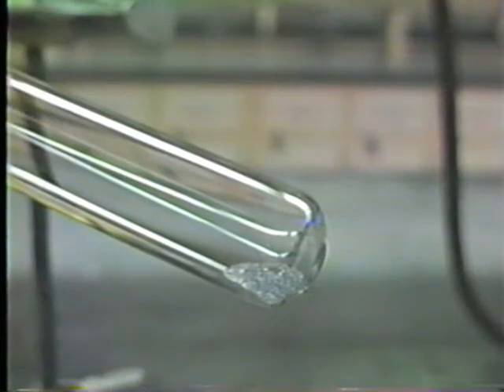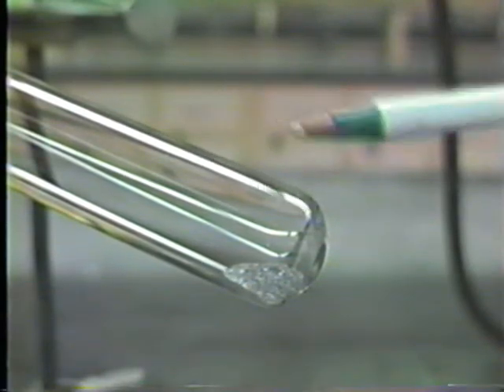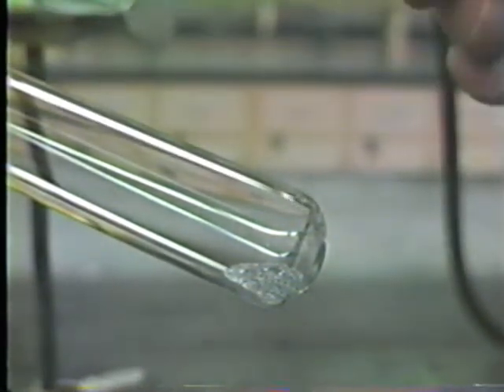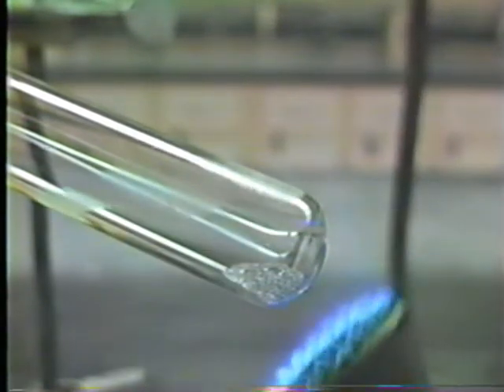Let's take a close-up look of that heating process. First of all, though, make sure that all the material you put in this test tube is at the bottom here, not along the sides. Now let's do the heating here. Start the heating.